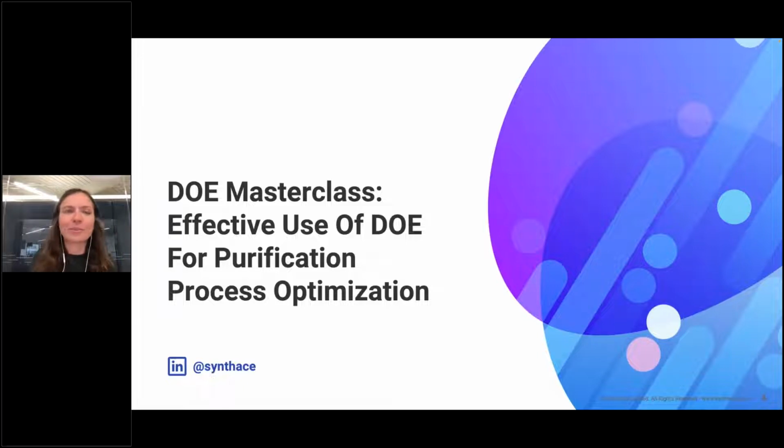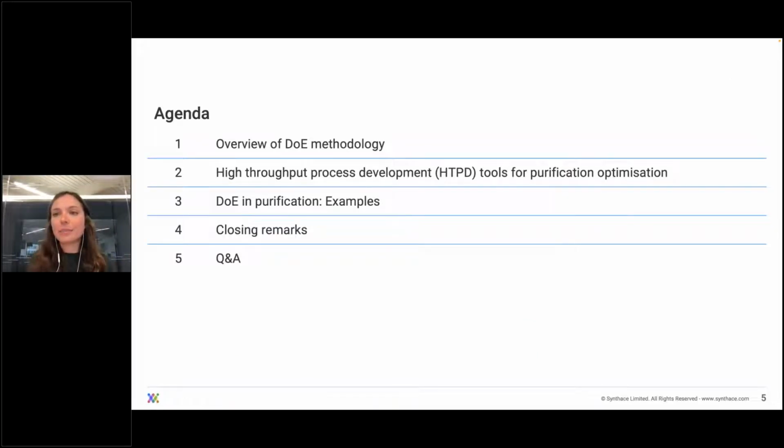So let's dive right into it. Thank you, Marcus, again for the great introduction. Today I will give you a brief recap of what the DOE methodology actually is. Then we're going to dive into what tools are available for employing DOE for purification optimization. Then I'll walk you through some examples of where we specifically apply DOE in purification, and finally close with some brief summaries and then go into the Q&A session.